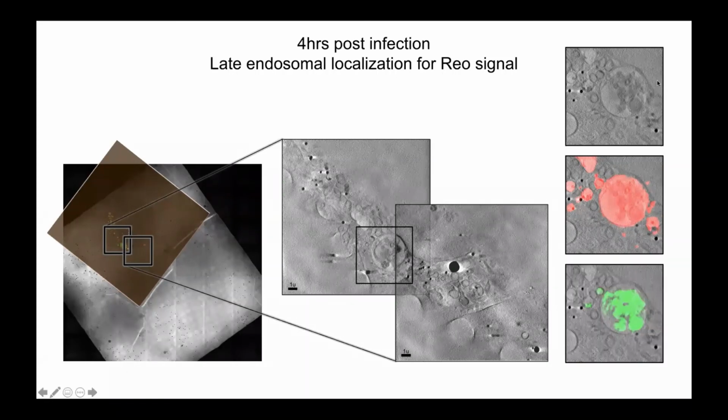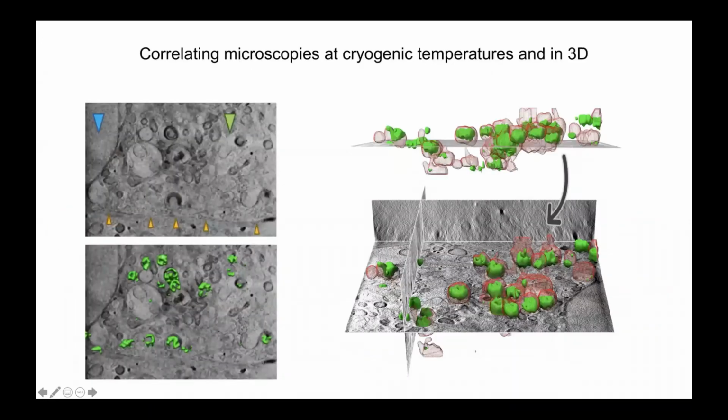And then we can clearly say that all the internal structures that we see are viral related. It could be viruses that were not perfect and did not release their core, or other components of the original infection. So it immediately becomes obvious which vesicles are involved in the whole infection and clearance process. Which means that once we have, and I've gone back to the 2 hours now just to show you the data set of the movie, which we'll see in a little bit also.